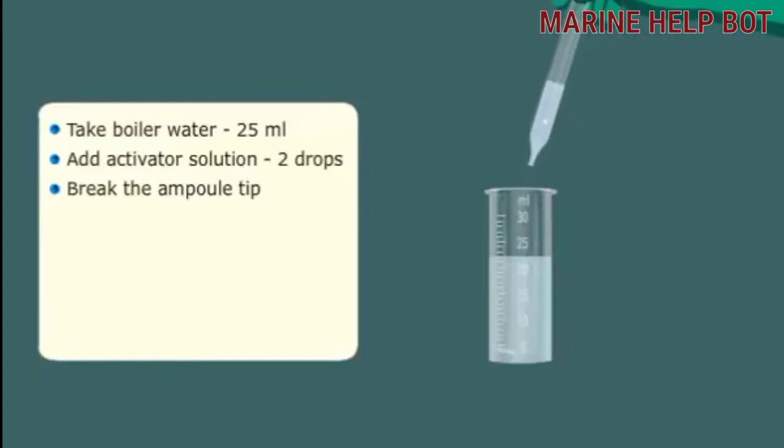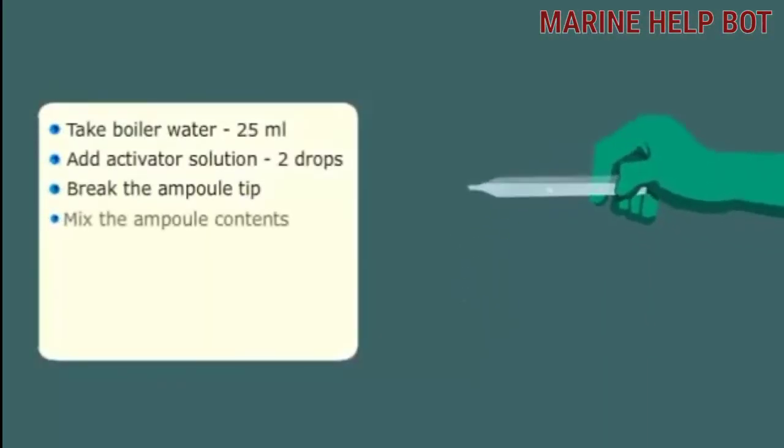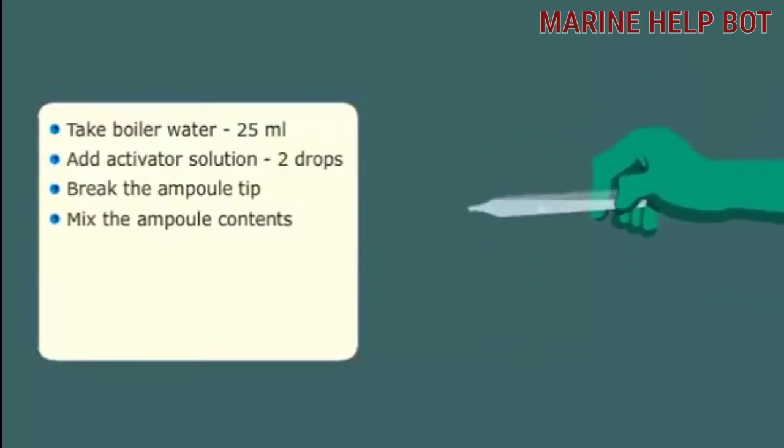Remove the ampoule and mix the contents by inverting it several times so that the bubble inside the ampoule moves end to end each time.